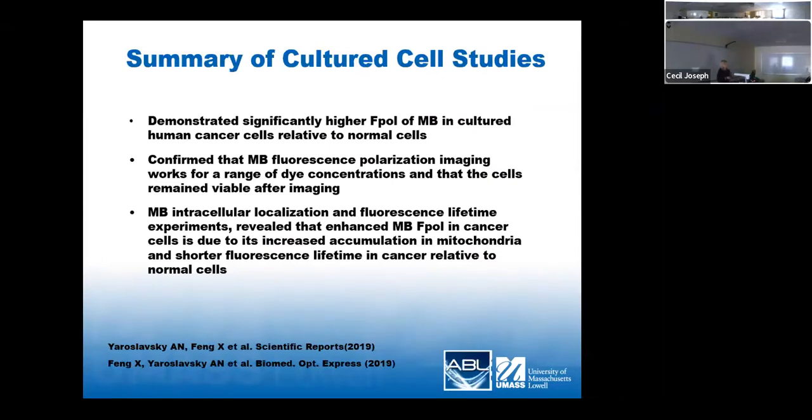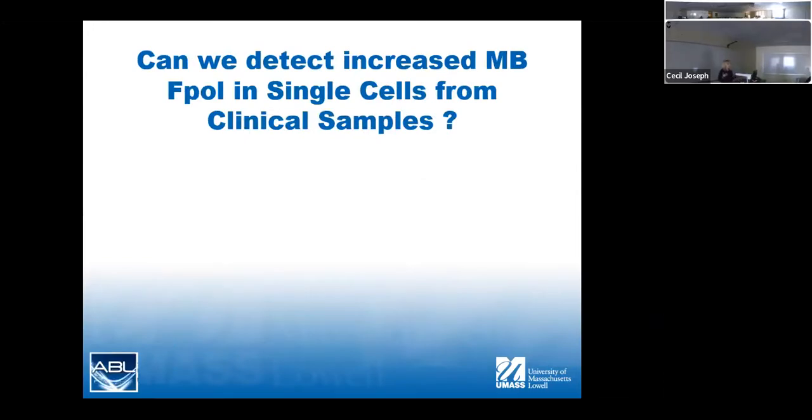So now, with all this demonstrated, we went for the funding again. And what we heard back is, well, that's all really very well. And in cultured cells, there may be such a thing, but you have now to show that it really works in clinical samples. And at that point, we had to answer the question, can we actually detect methylene blue fluorescence polarization in single cells from clinical samples?